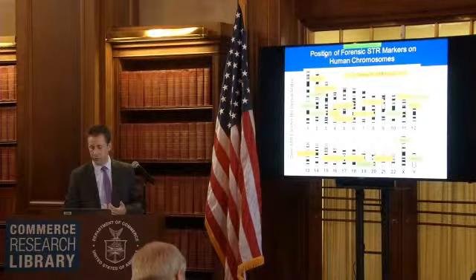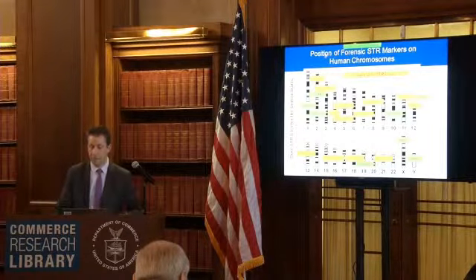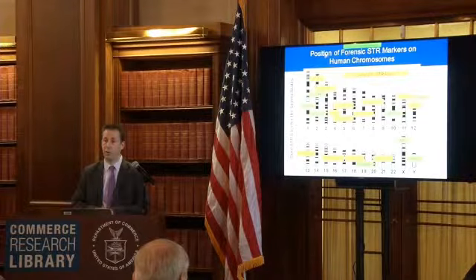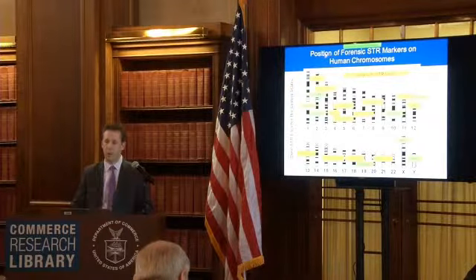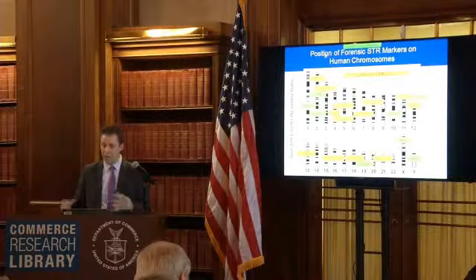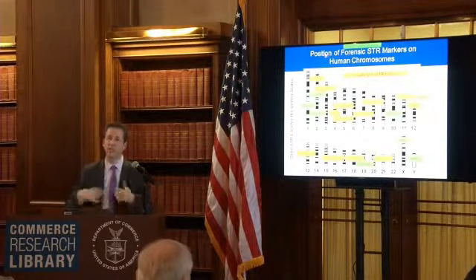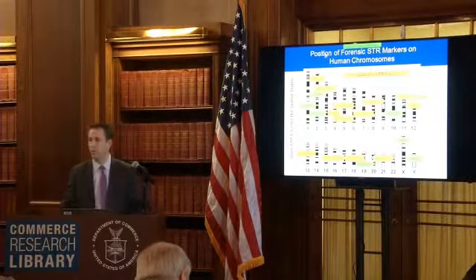You can see here also the sex typing marker, called amelogenin, with which you can know if someone's a male or female. And in the past, we didn't have a lot of harmonization or overlap with Europe. By adding some of these markers, they're also common in the European database, so it gives us a more international harmonization of the information. And just overall, having a core is useful. Every lab in the US that's doing testing is testing the same information, and you can share that in a database. So there was a question?